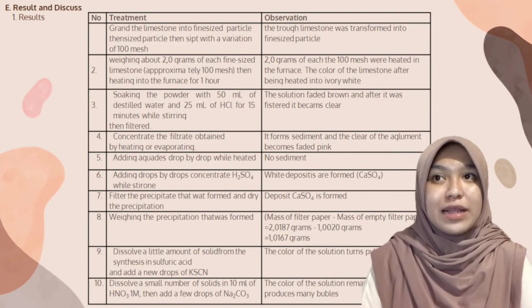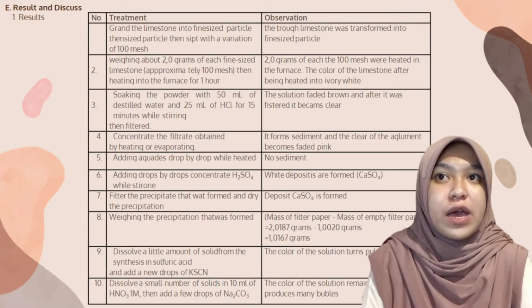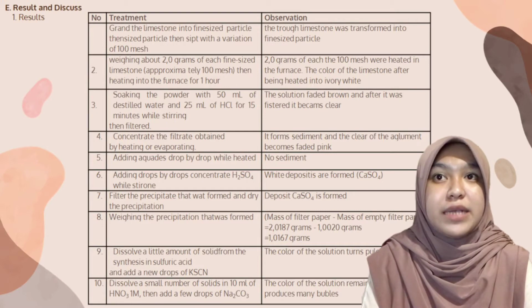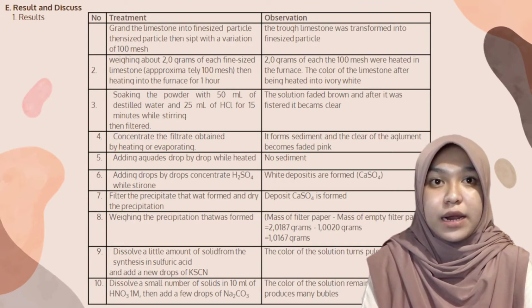Treatment 1: grind the limestone into fine particles, then sieve them with a variation of 100 mesh. Observation: the limestone was transformed into fine particles.